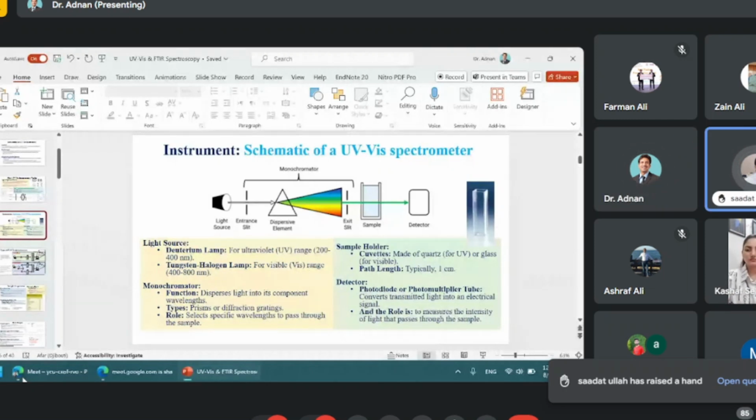Let's have 20 ppm solution. Now 20 ppm is out of the range of the UV. Normally I take 1 ml of this dye solution and put 2 ml of water into this solution. I got it.